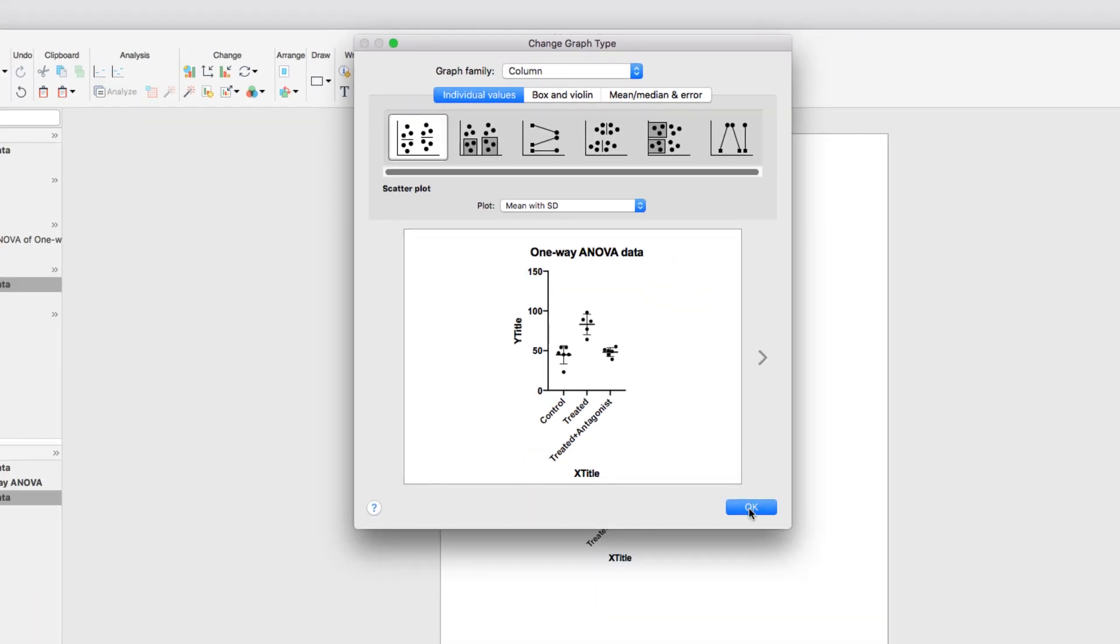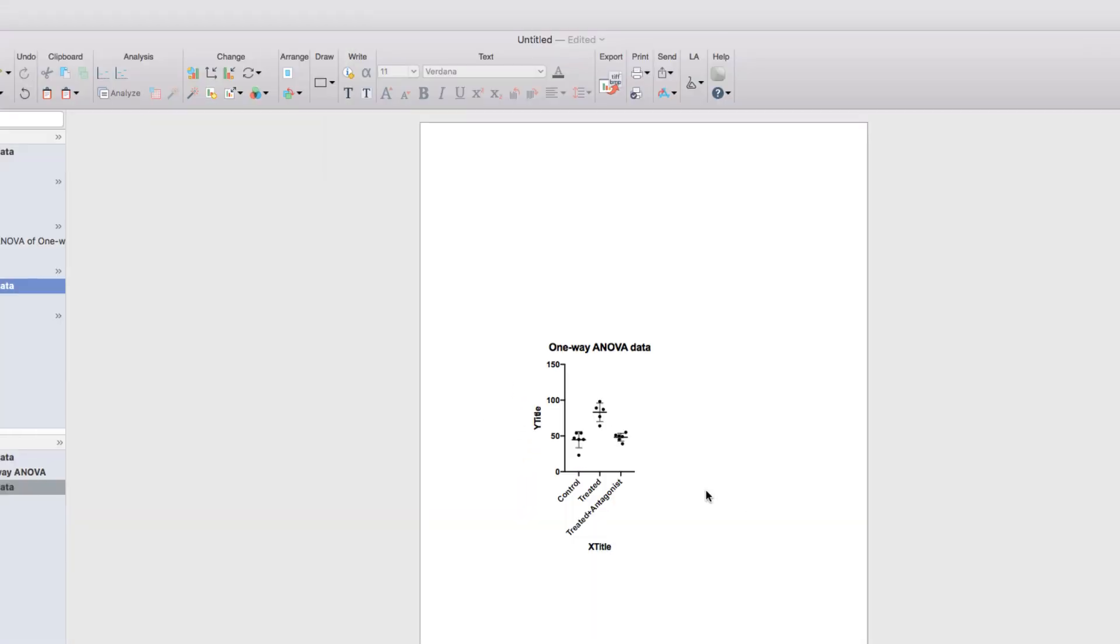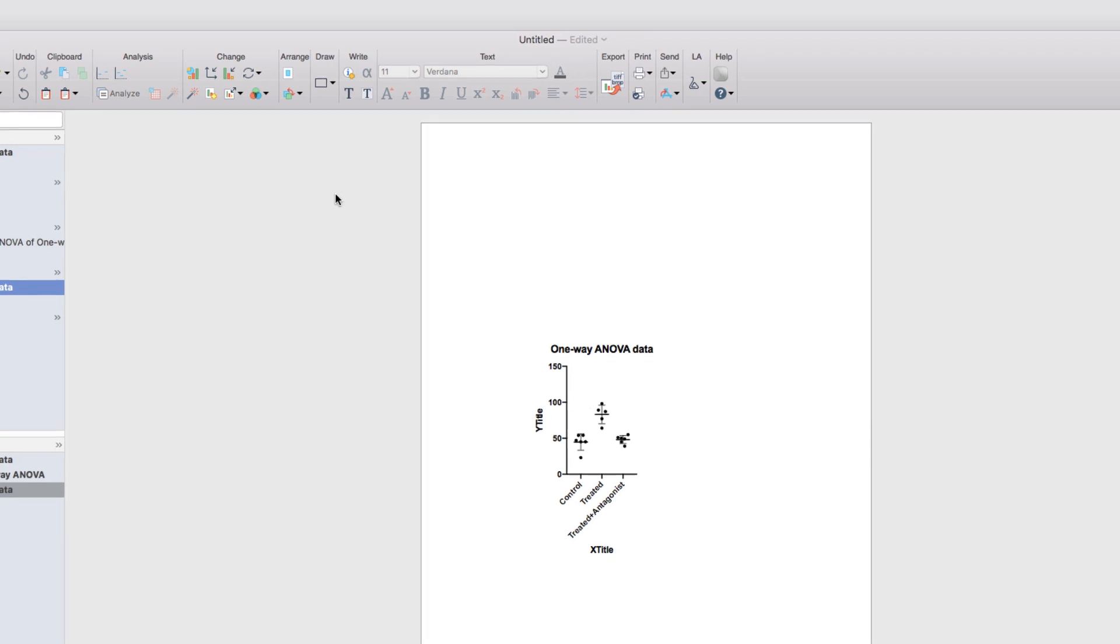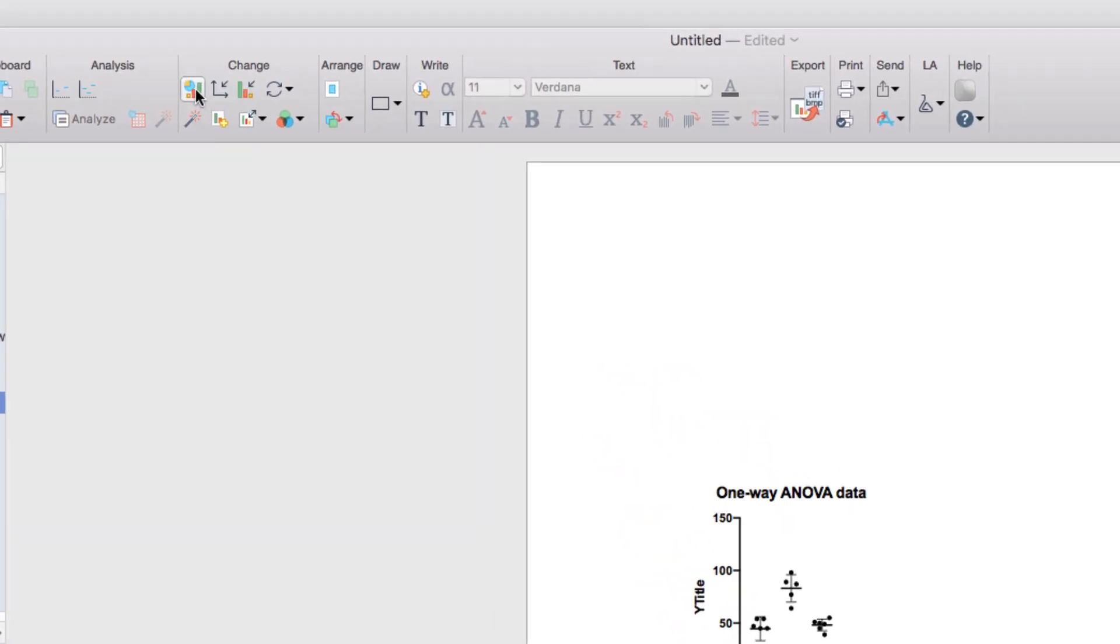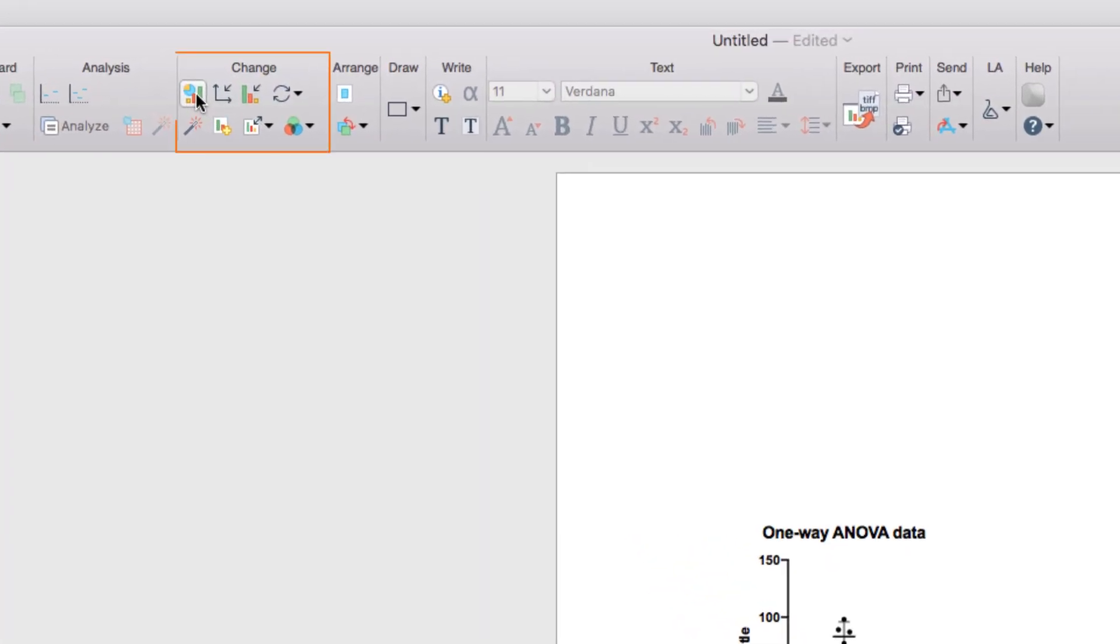When you click OK, your graph will be shown. However, if you change your mind later, you can always go back to the Change Graph dialog by clicking the button in the Change section of the toolbar.